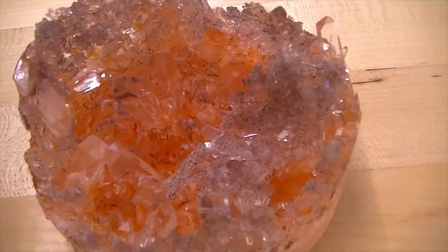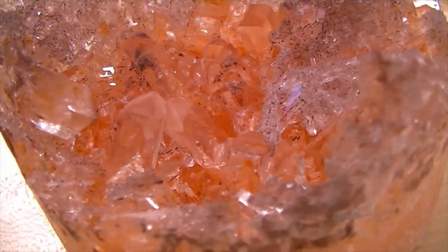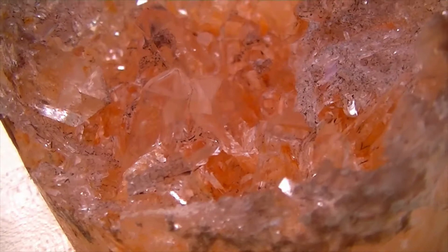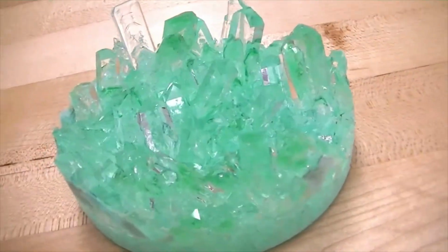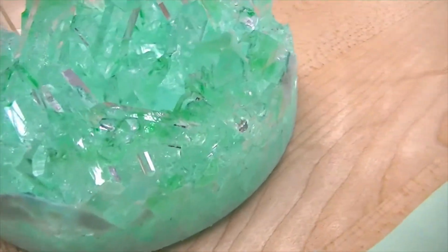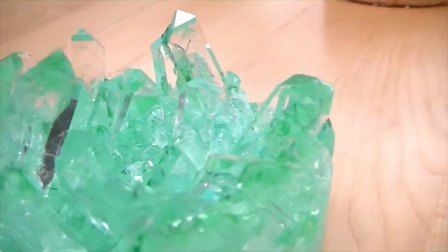Number 2 is kind of a strange one, 325 milliliters. There are some really good sized crystals in here, and a lot of small ones. And then number 1, which had the lowest concentration, seems to have some of the most spectacular, longer, taller crystals that grew.